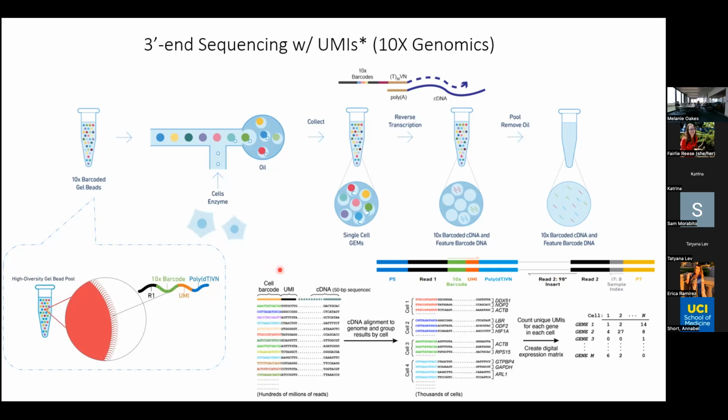When people bring their single cell suspension to us and tell us they're going to bring it at 7 p.m., that means we're going to be there a little late, because not only do we make the emulsion, and this step is maybe 18 minutes, not very long, but we need to get through this reverse transcription step. We need to make that first strand. And then we can store it, come back, and finish library construction.